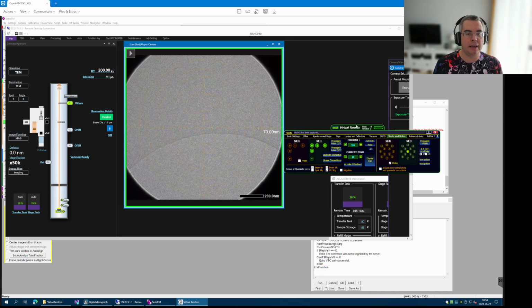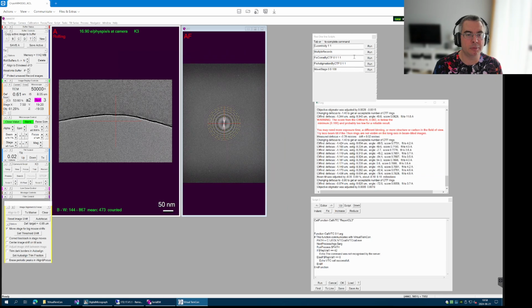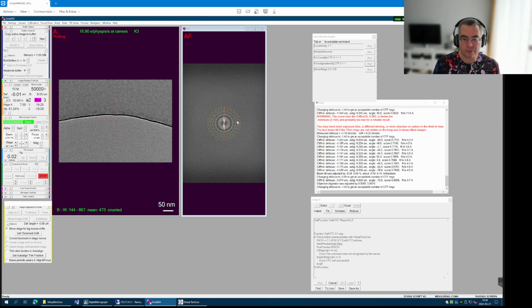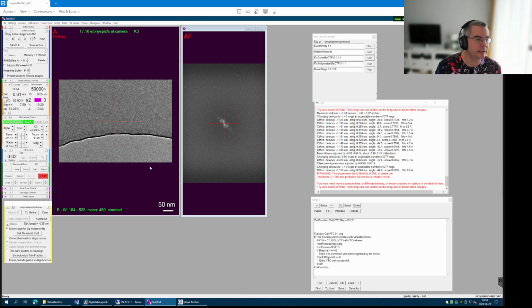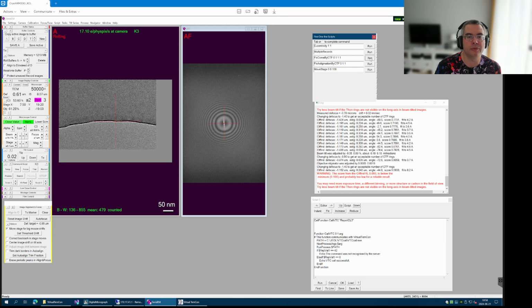Okay, and then let me get back to SerialEM and let me fix coma and astigmatism. So let's see what happens. Oh, let's try again. So we would need to be here in terms of positioning, and then we need to fix coma.